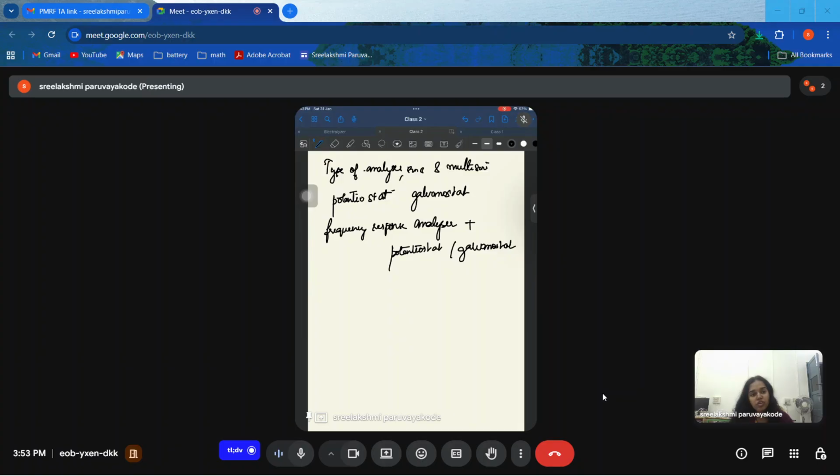Now, the range of frequency in which the experiment is done, when we are procuring the equipment, can be from 100 kilohertz to as low as 10 microhertz. So most of the data we will be getting from the mid frequency regime, like up to 0.1 hertz or 0.001 hertz. So do we need to actually go to higher frequency?